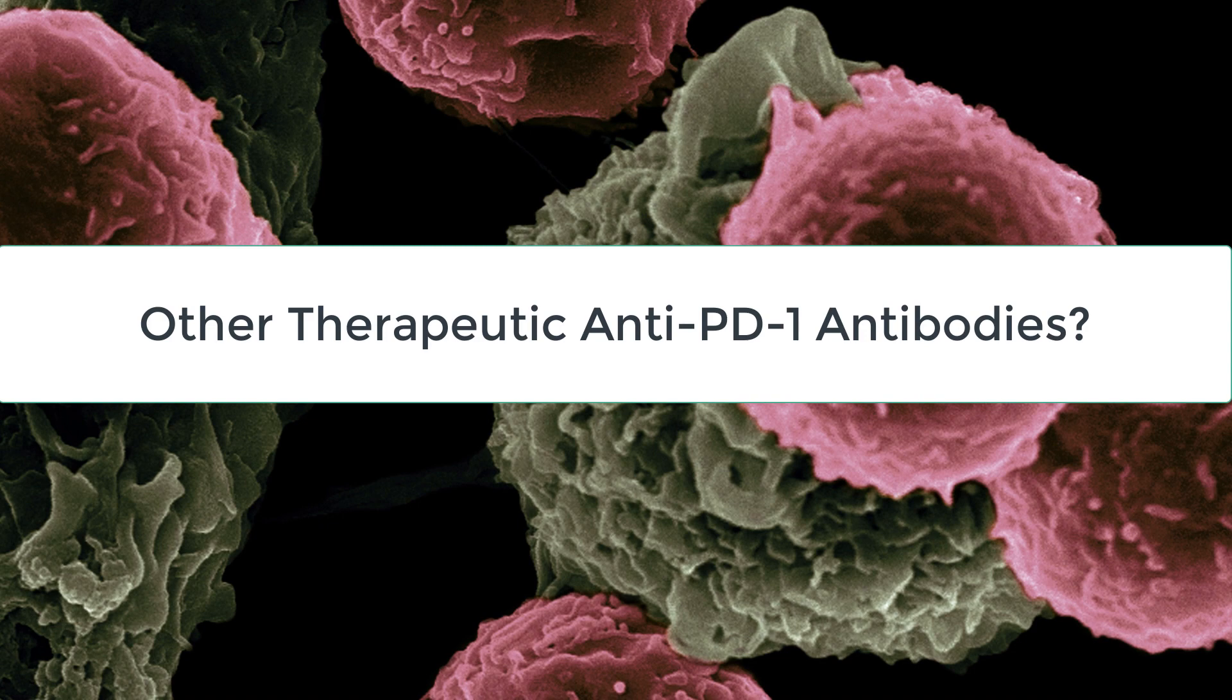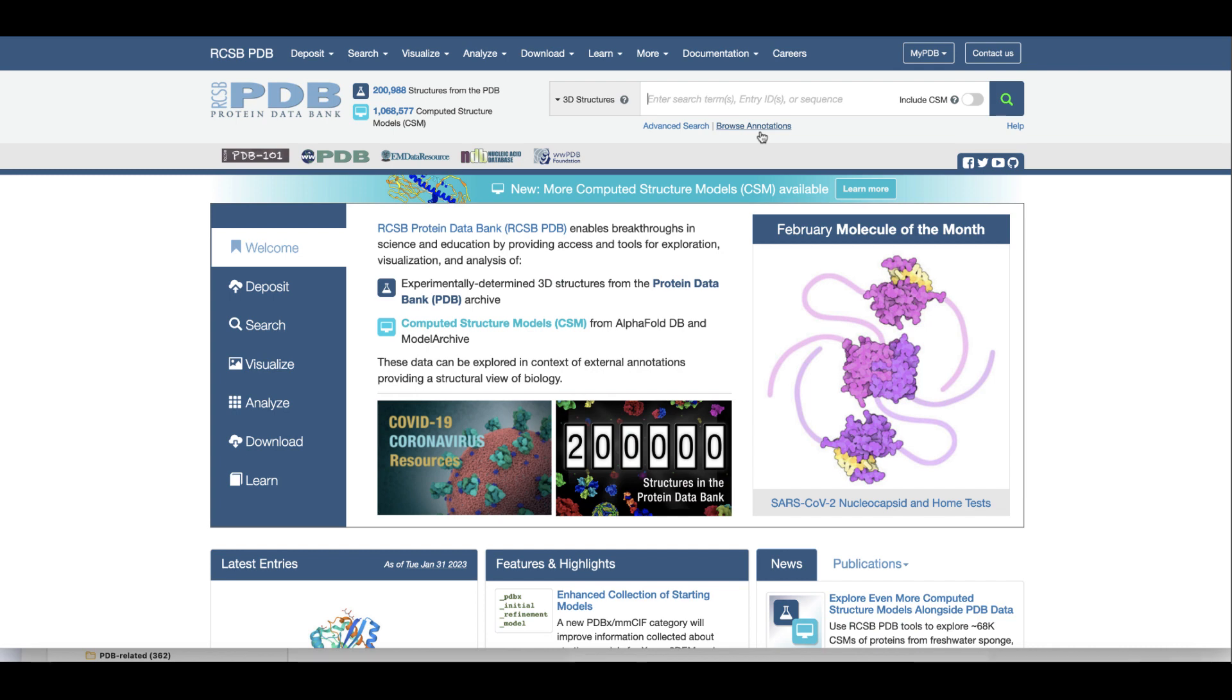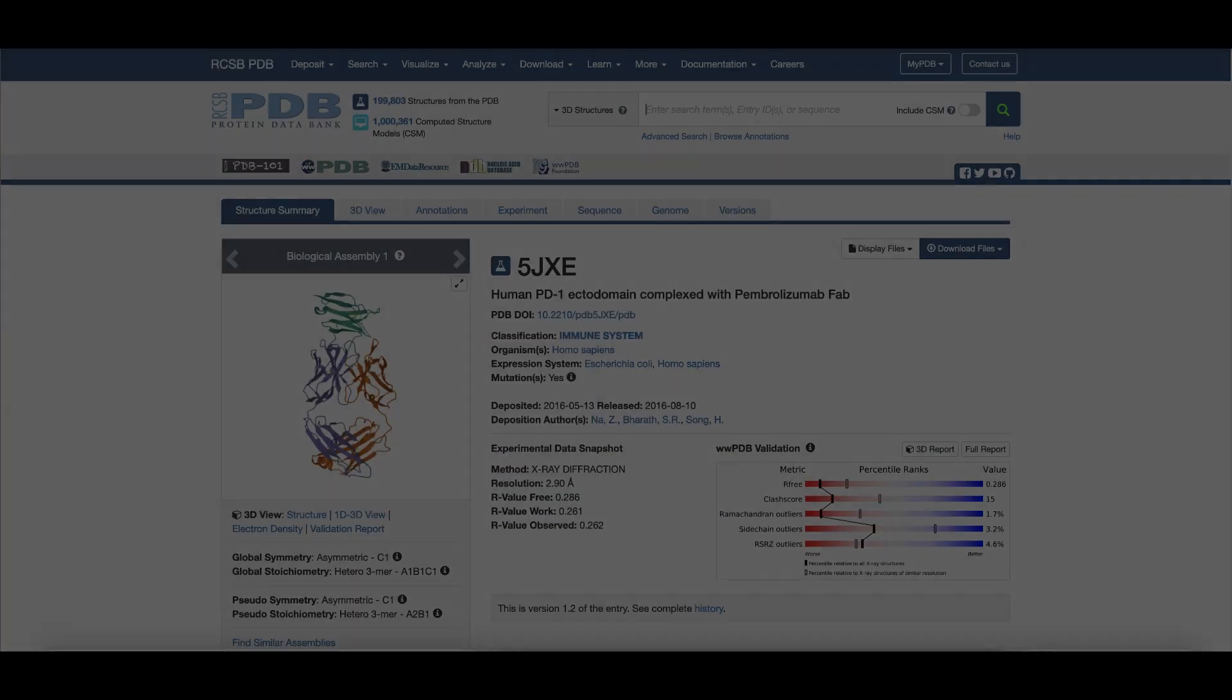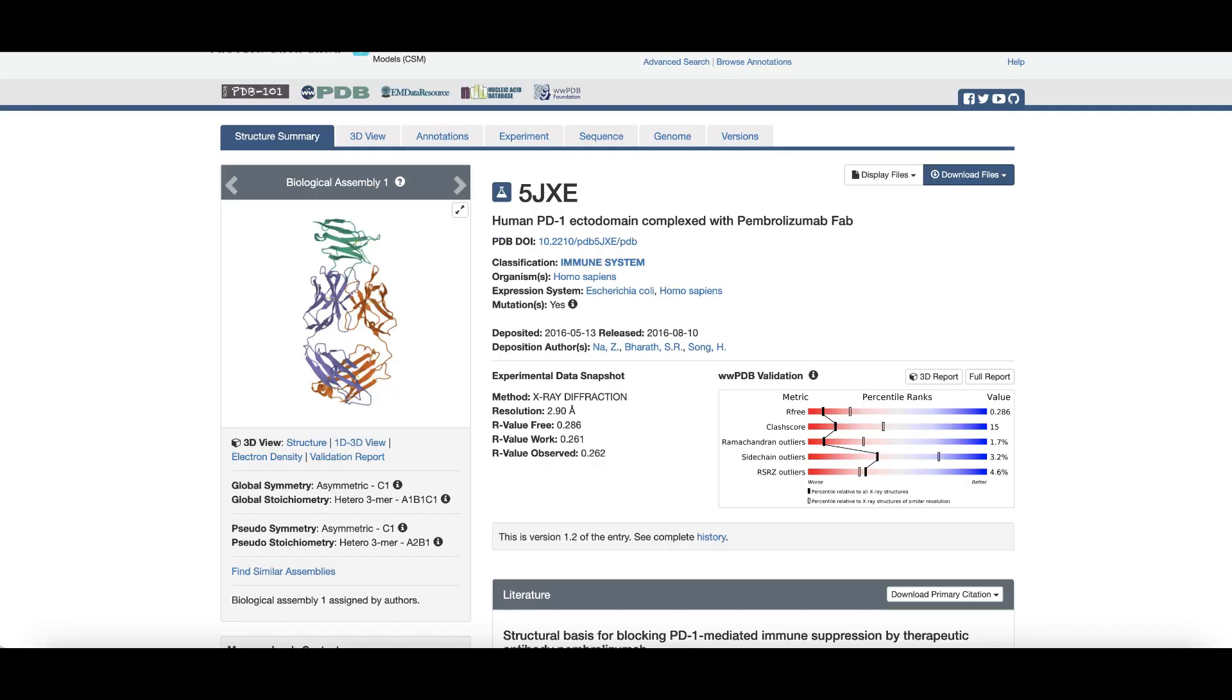Did you know that the U.S. FDA has approved other anti-PD-1 antibodies for cancer therapy? We can use some simple rcsb.org tools to find structures of PD-1 bound to these antibodies and examine how they work. Let's go back to the structure summary page for the PDB ID 5JXE.